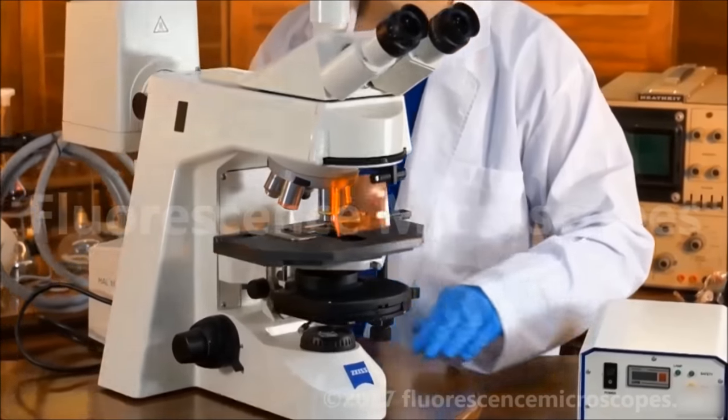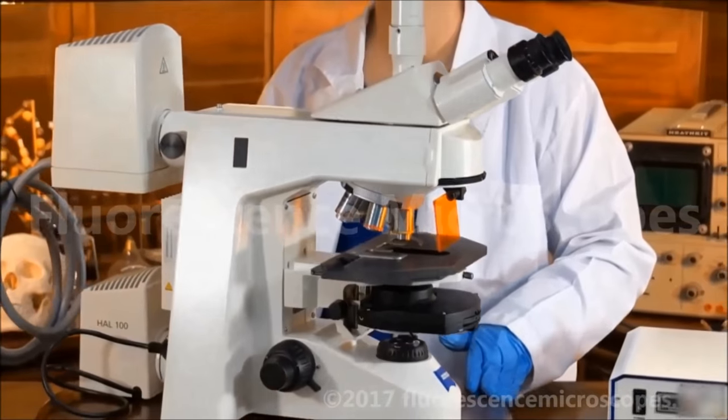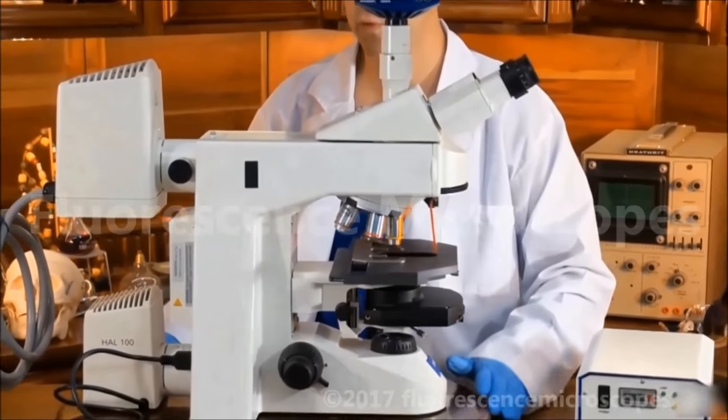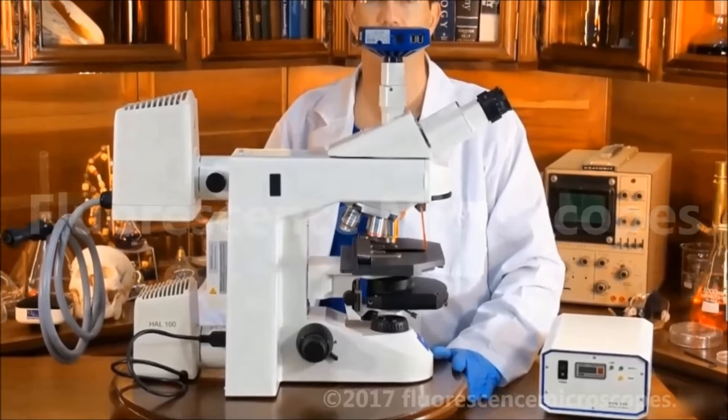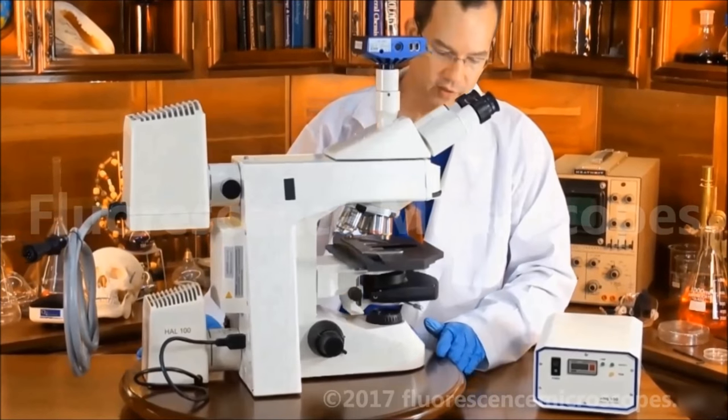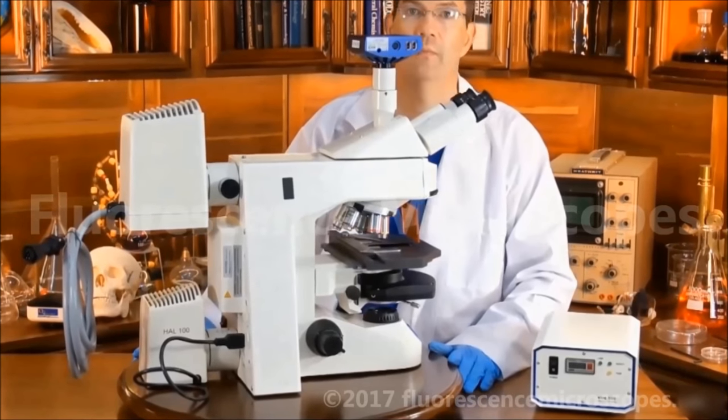If you have any questions about this Zeiss Axioscope 2 upright fluorescence microscope, please contact us. We'd be happy to reconfigure this however you may need. Thank you.